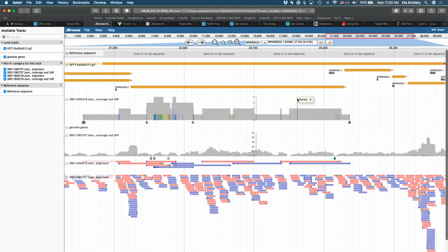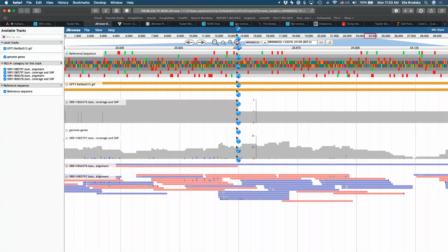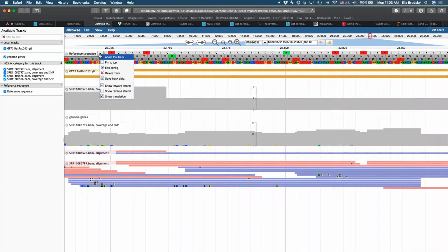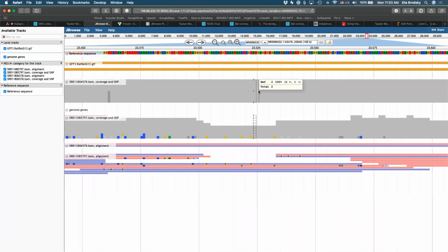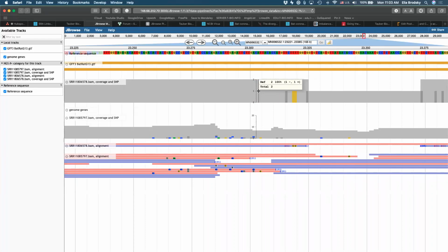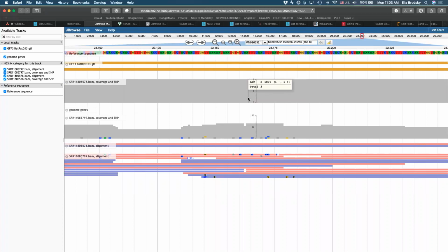All right, so here we can zoom in to see the actual sequence. On top here, we see the sequence. Again, I don't know if we need the reverse strand and translation right now. Let's just keep it simple. And let's take a look at what information we can actually see inside this data set. What else do we see beyond just the coverage?